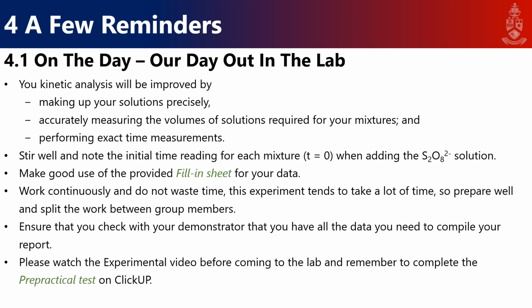And then also make good use of the provided fill-in sheets. Work continuously. Please do not waste time. This experiment does take quite long and you only have 3 hours in the laboratory. So prepare well. Split the work between group members. There's no reason that all of you should do the work together. So just split the work between the group members.